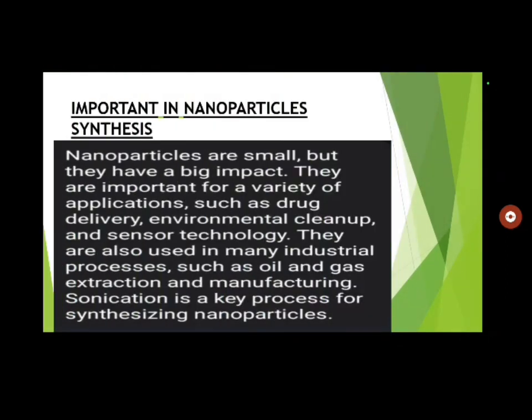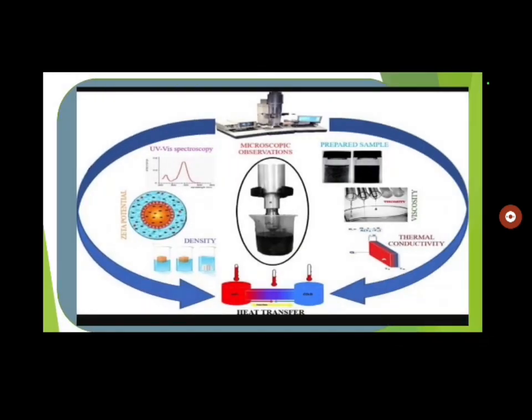Important in nanoparticle synthesis. Nanoparticles are small, but they have a big impact. They are important for a variety of applications such as drug delivery, environmental cleanup, and sensor technology. They are also used in many industrial processes such as oil and gas extraction and manufacturing. Sonication is a key process for synthesizing nanoparticles. Here is a picture of the sonication process.